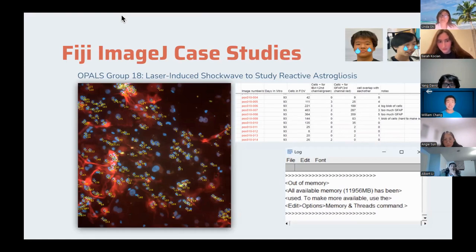And then, using Python for Cellpose, you can load your own models and train your own models instead of using the GUI provided. You can use that for better analysis or more automated analysis. I guess that's about all I've got to say for now.